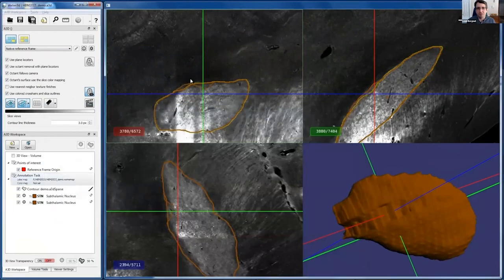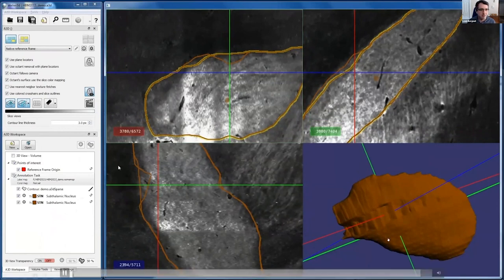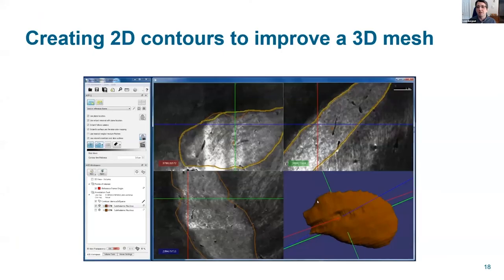So now we're opening the second mesh. We see them in overlay. We could change their color, make them transparent in the other quadrant to do some sort of analysis. Hopefully through Mona's work, we will have quantitative analysis of differences between meshes straight in the software. It's not there yet, but it's coming. And so we're actually doing extremely good on time, meaning it should have probably taken more time to discuss some features, but we can do it live at the end. That might actually be excellent.